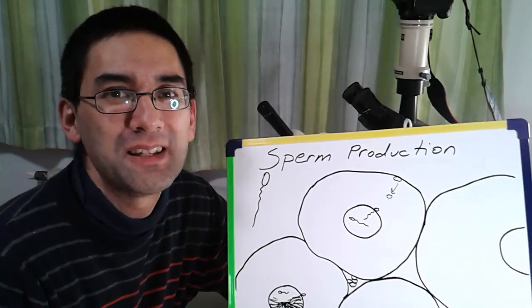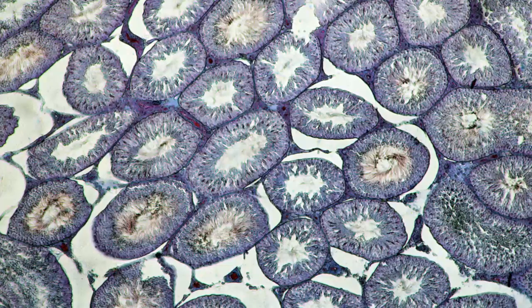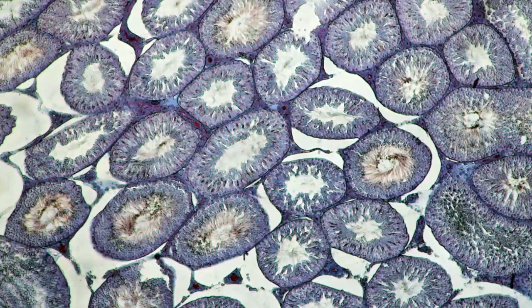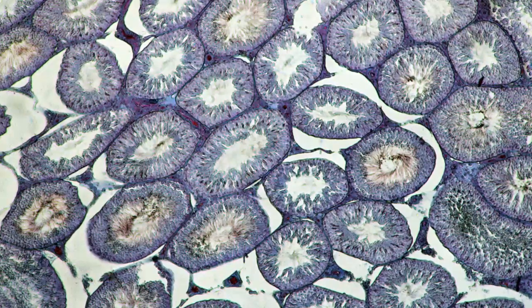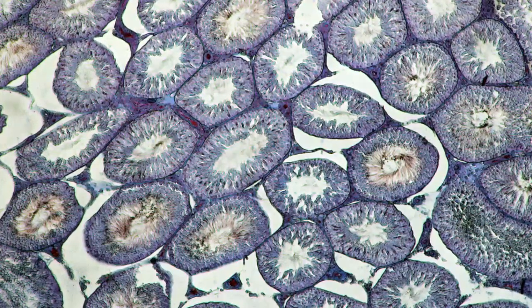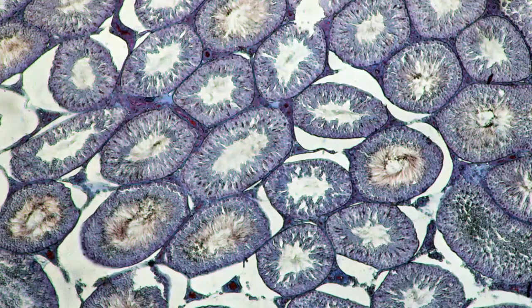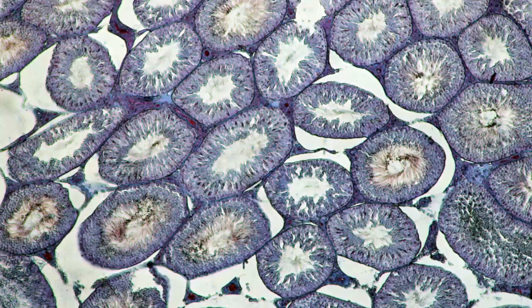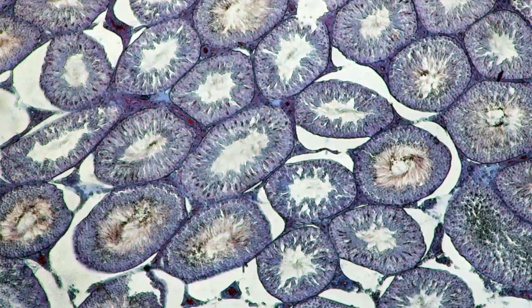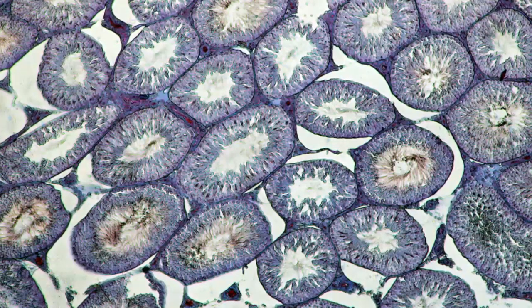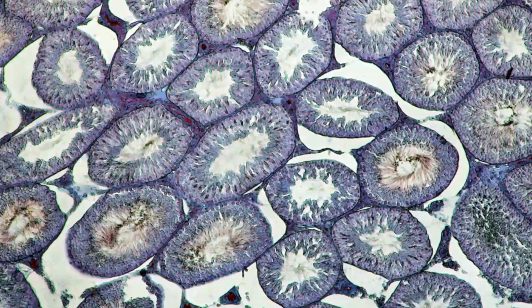So now let's go to the microscope and let's have a look. We are now looking at the testis tissue at low magnification, and you can see many of these tubules. However, the magnification is not really high enough yet to see the tails of the sperm cells. You might see a little bit of a grayish discoloration inside each tubule. Well, these are the tails, but they're still too fuzzy and too blurry to be seen. So we need to go to a higher magnification and to a higher resolution.